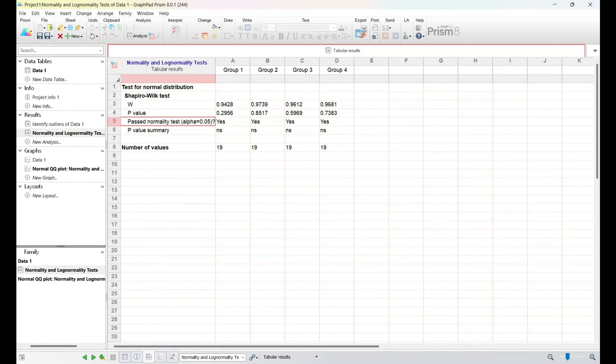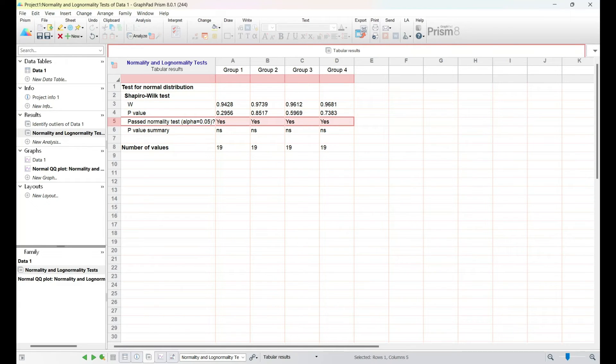Remember, GraphPad Prism simplifies the process, allowing you to focus on the insights your data holds.